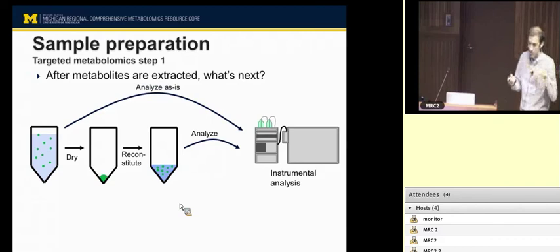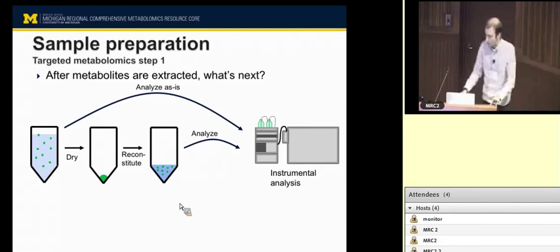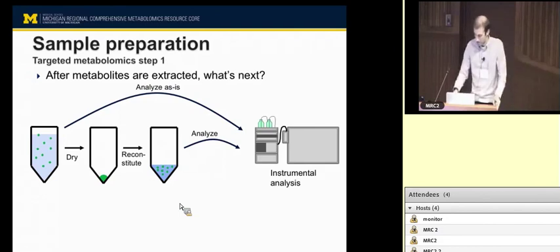It can be, especially in the context of untargeted metabolomics data, if you're new to the field, there may be some need for some interaction. What does this mean? What do we think about where this is going to be useful? And how does this inform my next steps in the study?